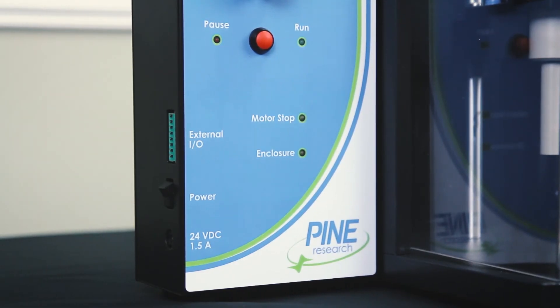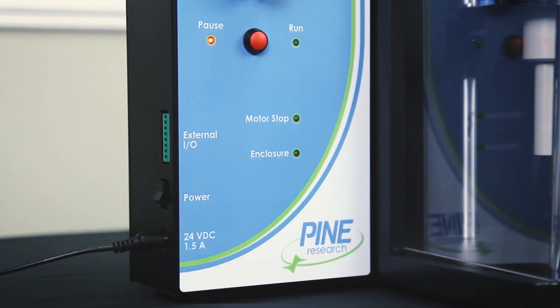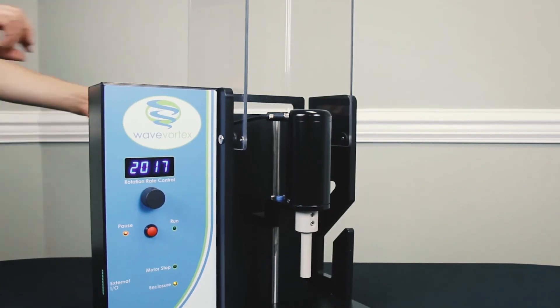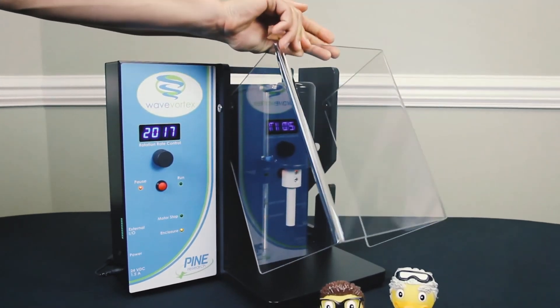Plug the wave vortex back in and turn it on. Awesome. At this point, you have successfully replaced the shaft on the wave vortex rotator.